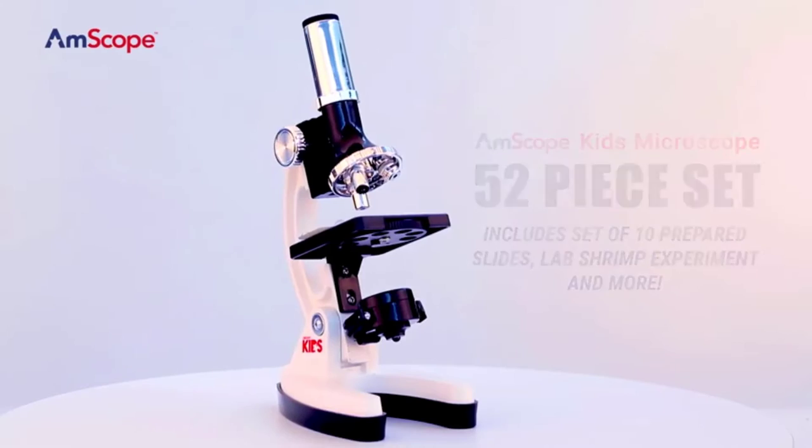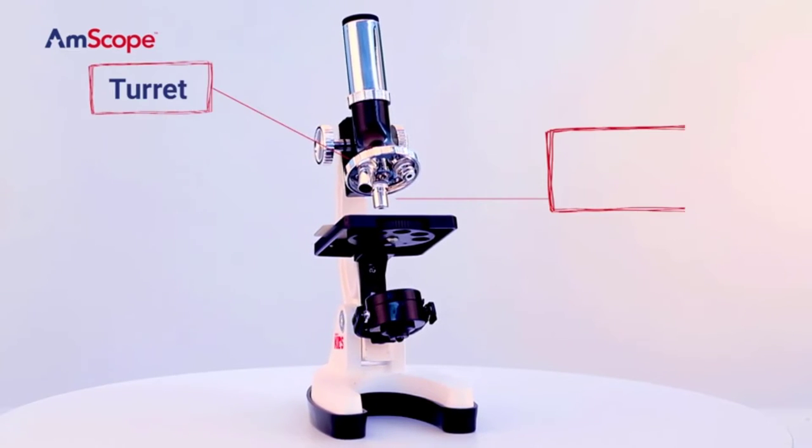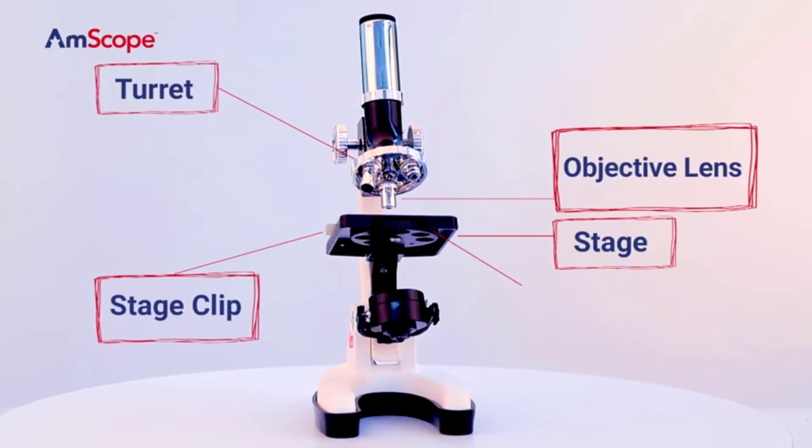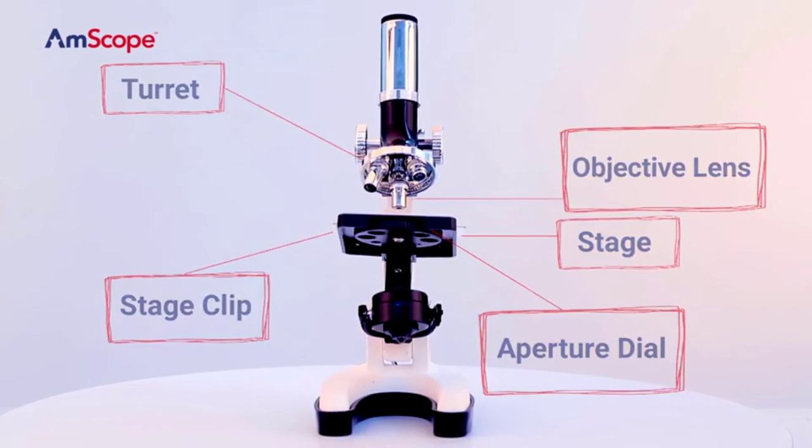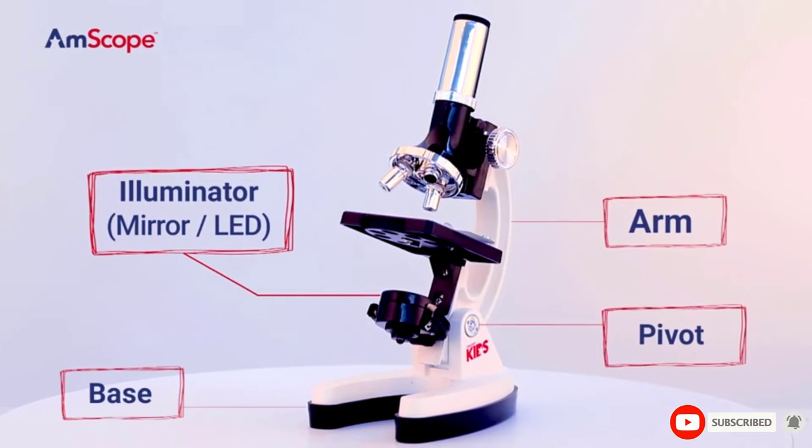120x, 240x, 300x, 400x, 600x, and 1200x. The color filter wheel makes samples less aggressive to view in certain environments. The built-in LED adds a light source for easier viewing.